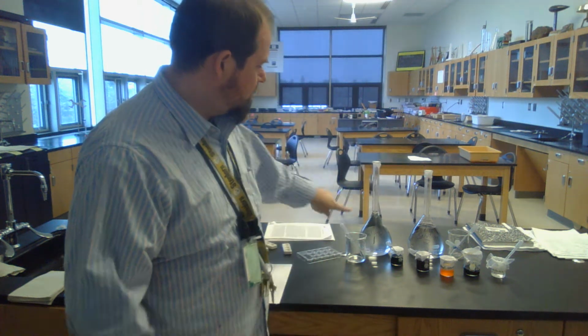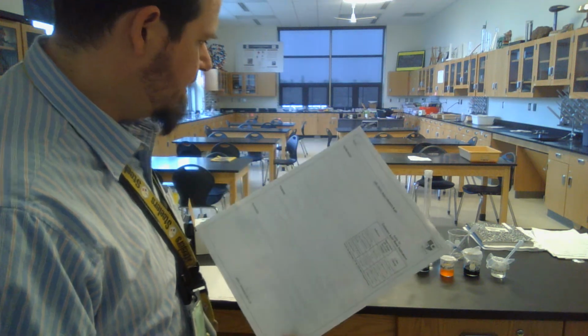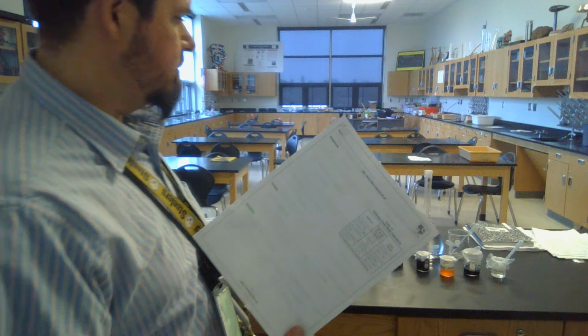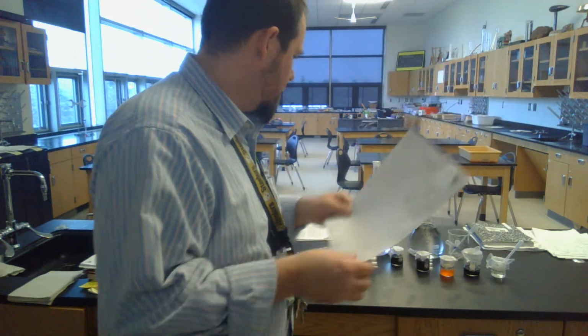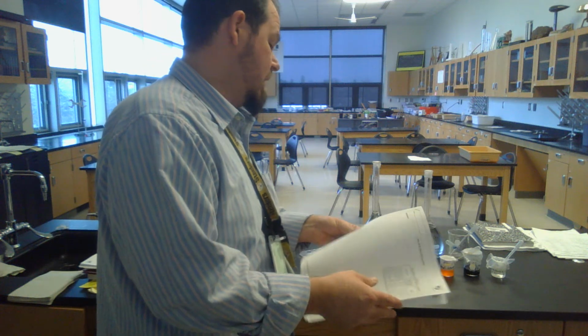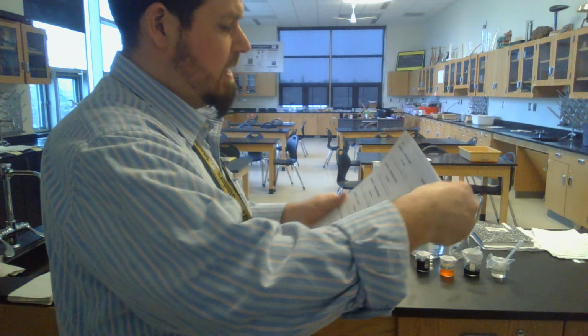Background. I have two unknown solutions, and you're going to be able to tell me the pH of the two unknown solutions. You're going to guesstimate a good range. Okay? Procedure, I'm going to go through that right now. And there's some pieces ahead of time that I want you to do. So this is your actual data table.